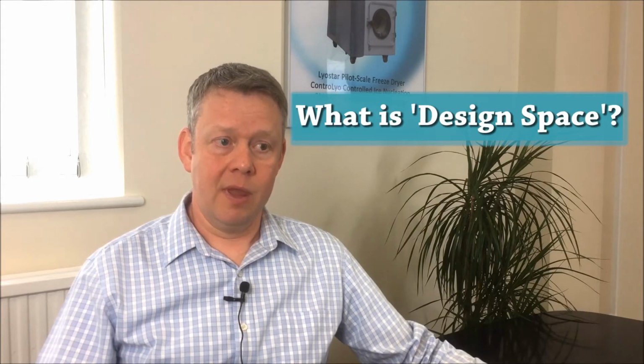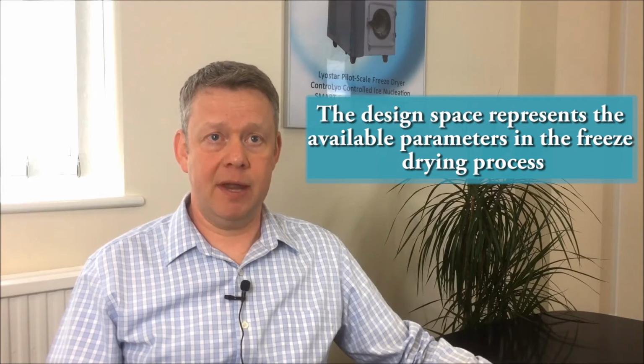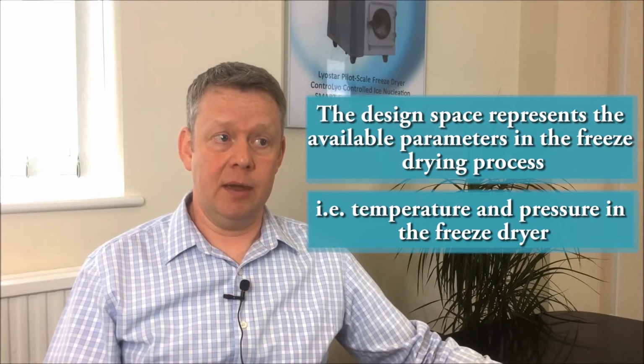Okay, I mean, you mentioned design there. What's this thing about design space? Well, the design space represents the available parameters, in our case in the freeze drying process, so the temperature and the pressure in the freeze dryer in a given freeze drying cycle.